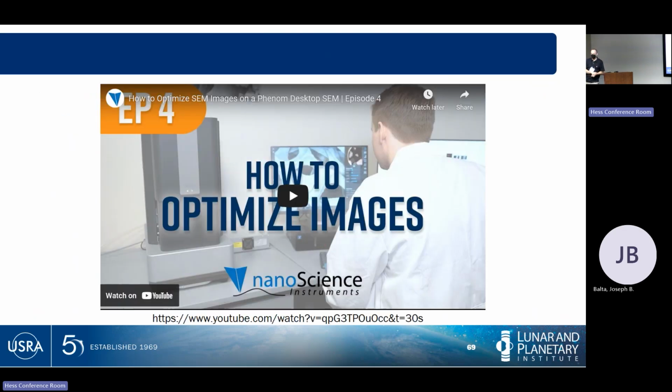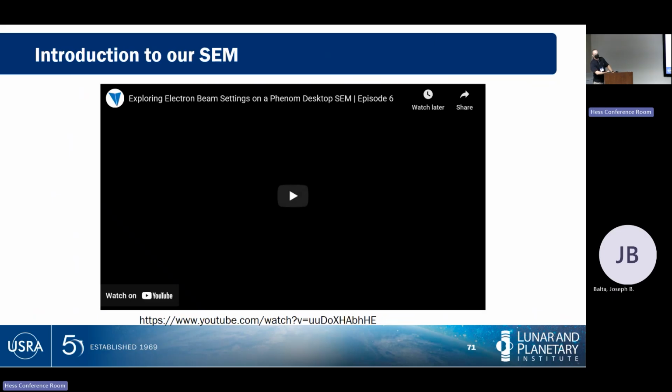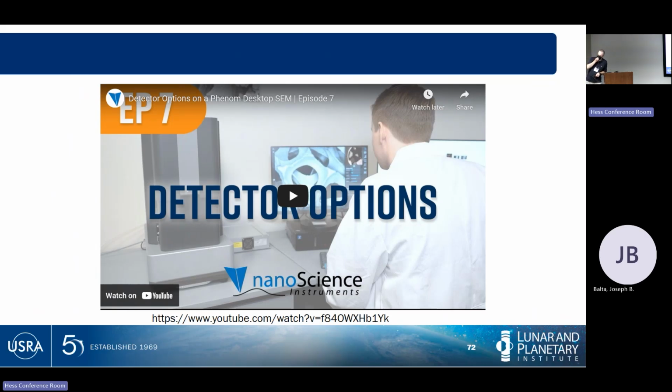They have a whole YouTube page featuring things like how to optimize images in a Phenom desktop SEM. How to optimize images, part 2, electron beam settings, okay? Detector options, okay? What's all the stuff we just went through? What are you going to be playing with this afternoon? Beam options, how to optimize an image, detector options, and so on. They go through the same stuff here as a secondary resource.